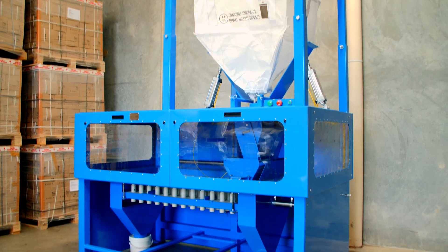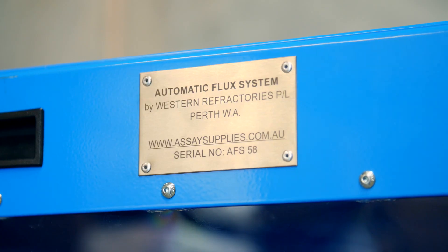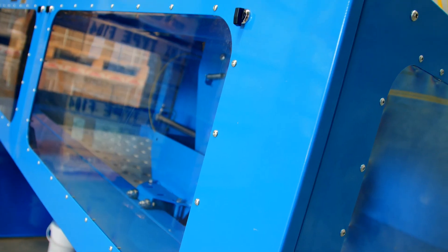Over 17 years of research and development and more than 11 years of use in the field has created the Westref flux dispensing system for use in fire assay laboratories. It has become an essential component of operating a safe, high-volume laboratory the world over.